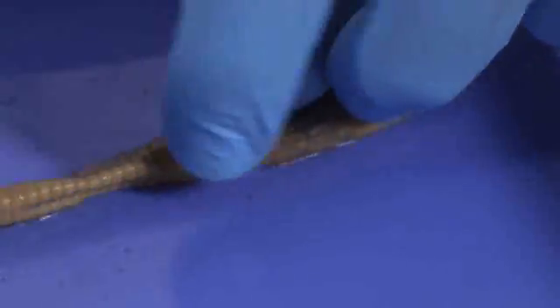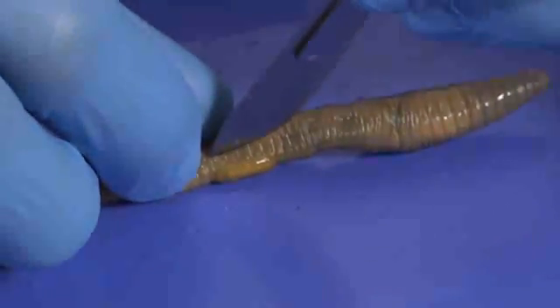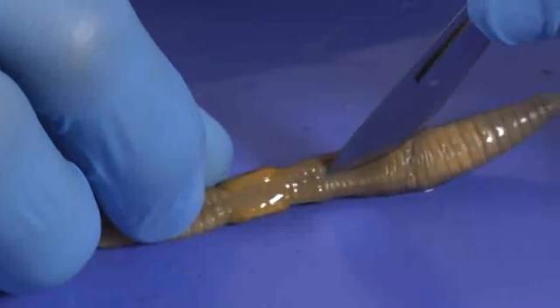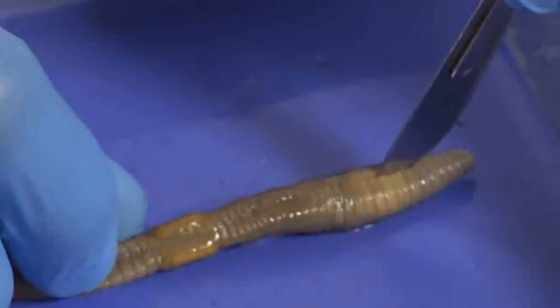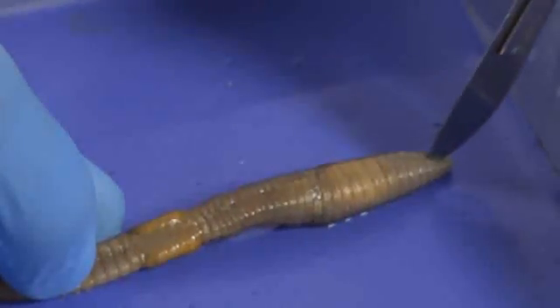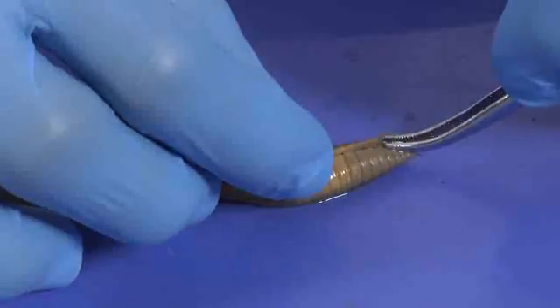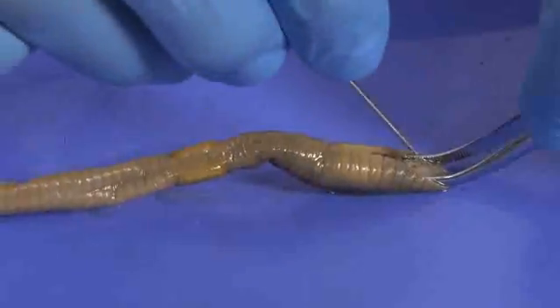Now I'm going to turn the earthworm over and make a shallow cut on the clitellum. I'll spread the incision using my forceps, and pin down the sides of the earthworm with the dissecting pins.